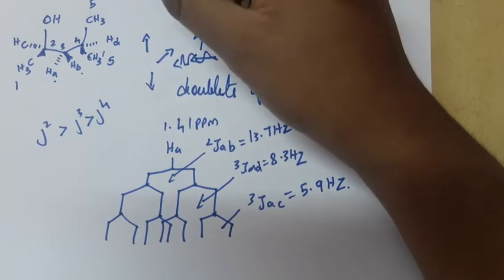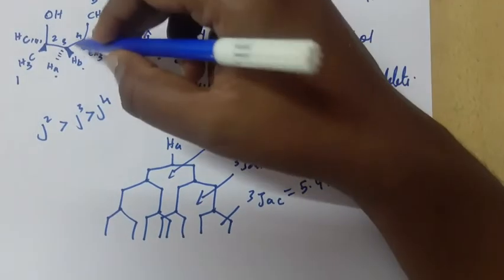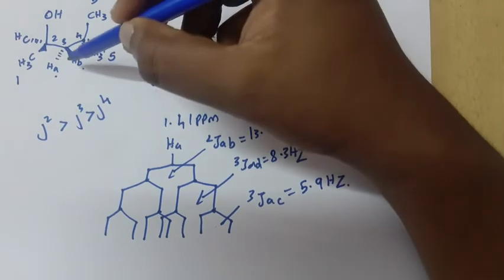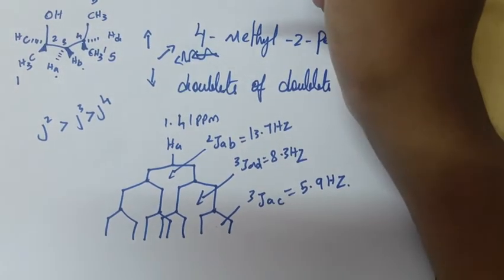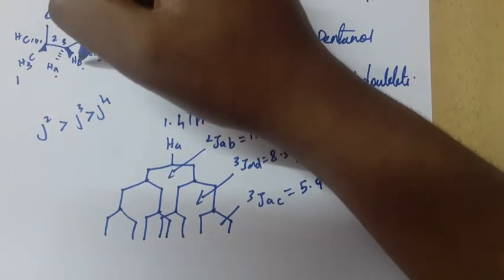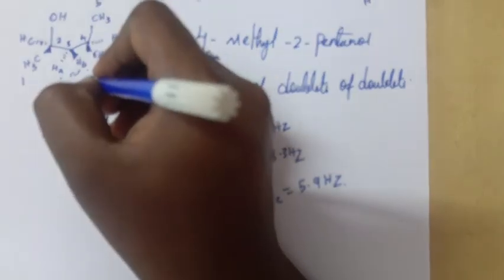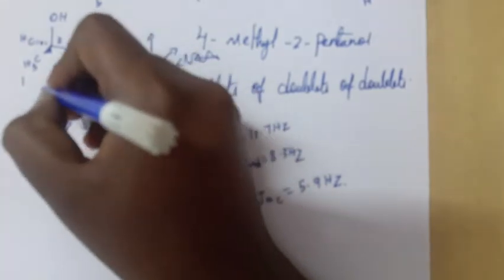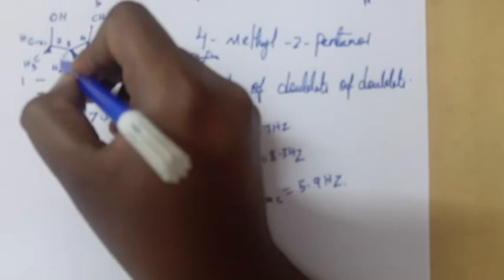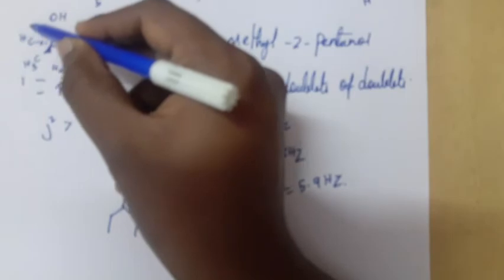It's going to change the spin of the nucleus, and a nucleus is not in a free environment. It always has other nuclei near it, and that's going to decide how the NMR spectrum turns out. So I have this HA proton, and I have an HB. It's going to affect its spin, based on whether it's up or down. It's going to give 2 levels, and these 2 levels are first affected by the nearer proton, where the effect is more, and later we have a proton here.